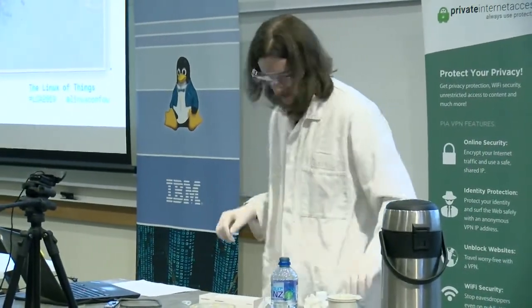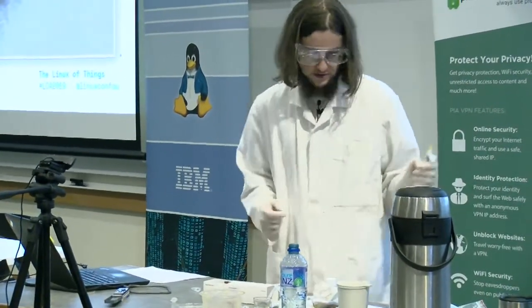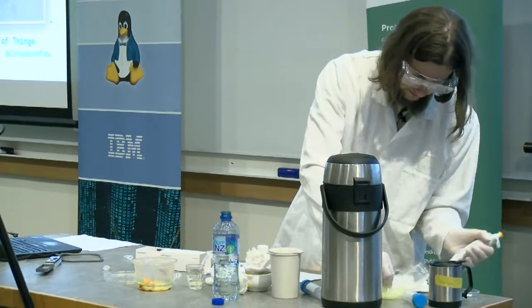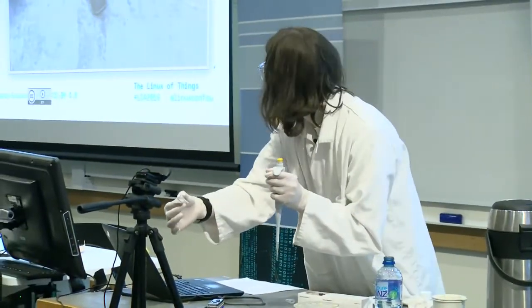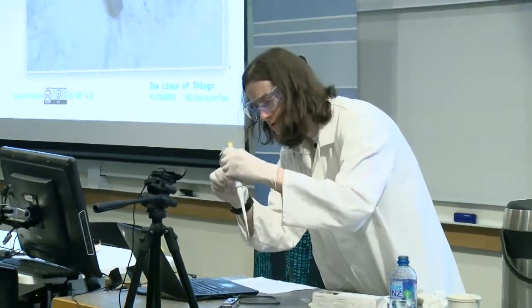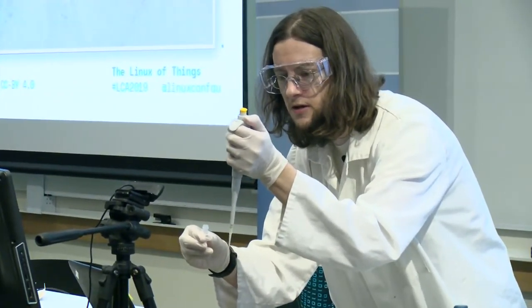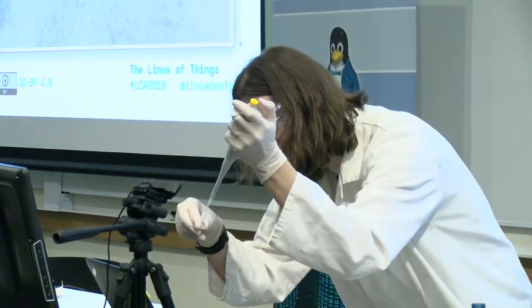Right. Next thing is a fragmentation mix, which is happily provided by the sequencing kit. Now this one has RB01 on it. Maybe I shouldn't care so much about focus. And I need 2.5 microliters of this. I'm not going to do the maths on that.